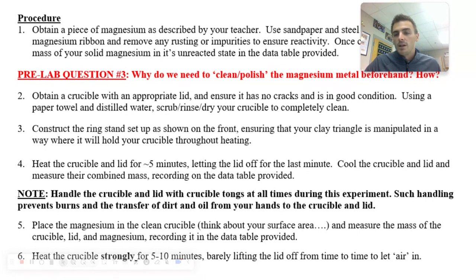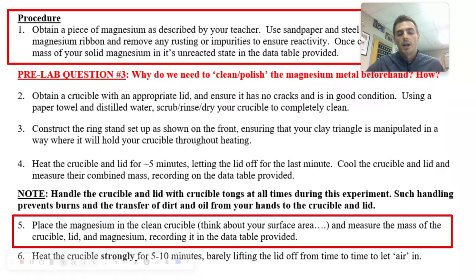And it's important, we know that reaction isn't just going to happen. Even rusting takes decades of years. So we'll help it out by providing heat. Like I said, I'll assign everyone coil or tear, and that's how you'll end up putting your magnesium in there.